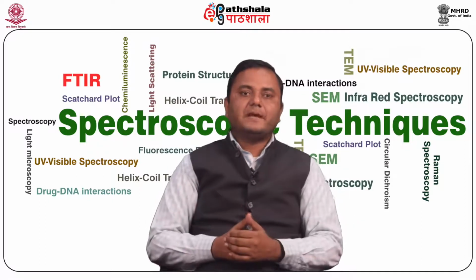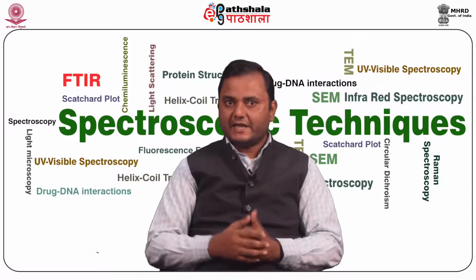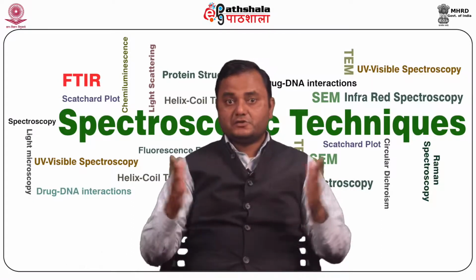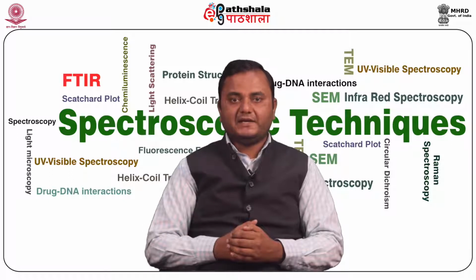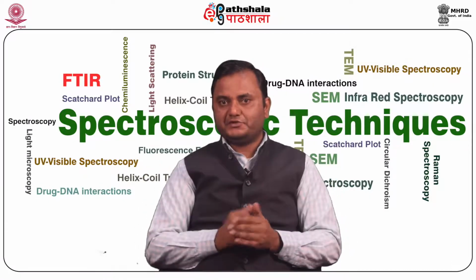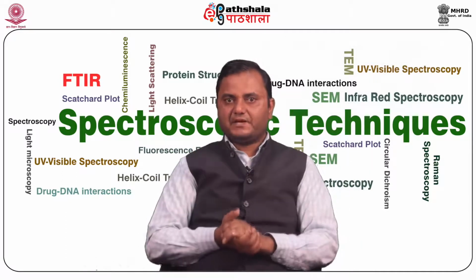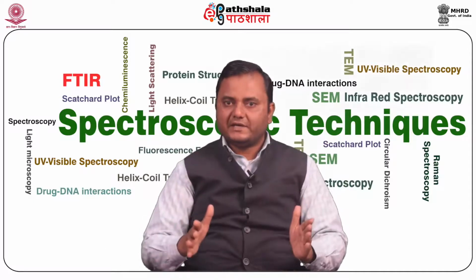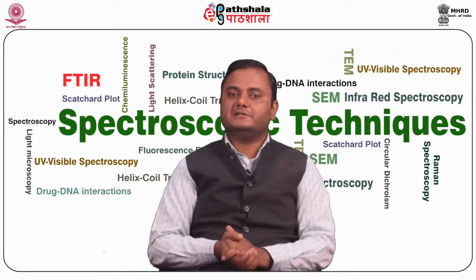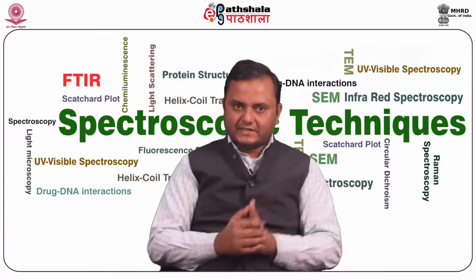Now we talk about the applications of FTIR. FTIR is widely used in different areas. In chemistry it is used for the identification of functional groups. It is also used for trace analysis of raw materials and finished products. For example, if you developed a product and you want to check that it does not have any contamination, then you scan for that particular wavelength. If the peak is not appearing for that contaminant, it means the sample is fresh. Or you can compare with the known IR spectrum of the fresh sample with the other sample.